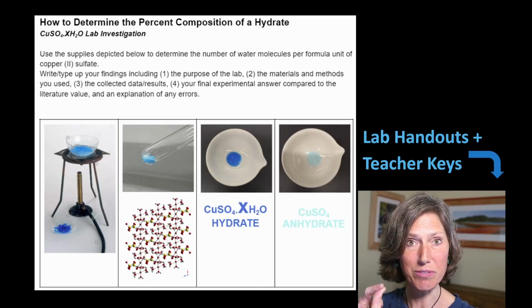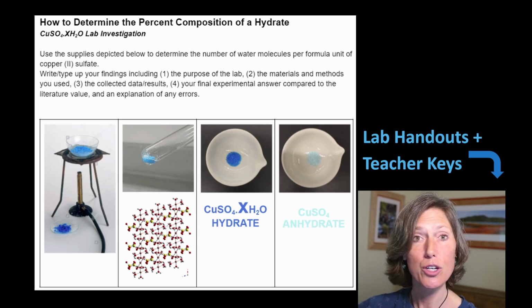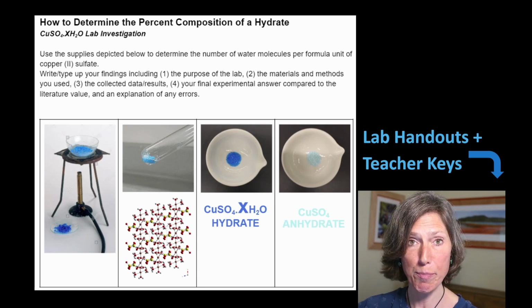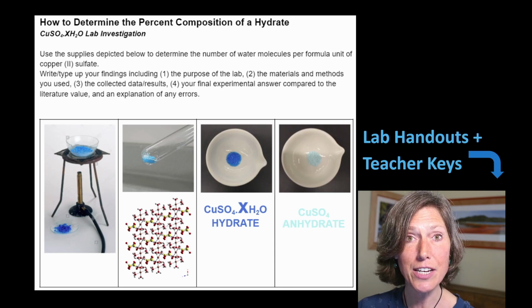All right, we've got the phenomenon. There's water on the moon. How can we get water out of rock if there is no water present? I shared with you the two methods that I tried with my students, the evaporating dish method and the test tube method. Let's now look at the handouts.